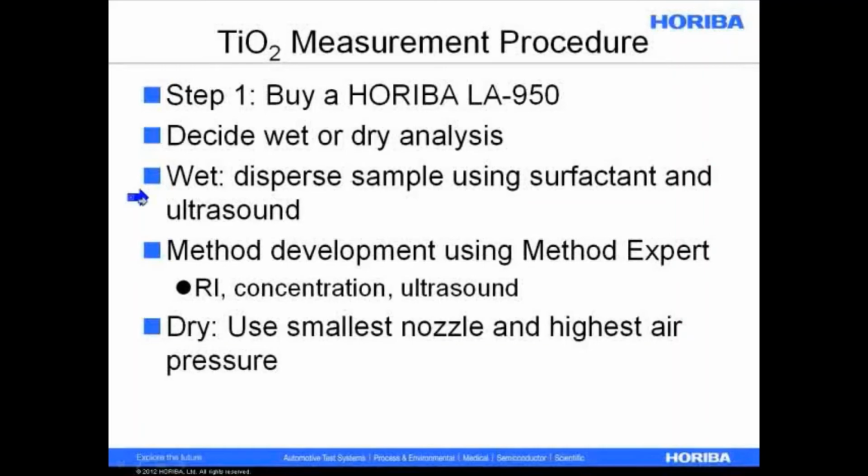Sometimes, often it's dispersed in sodium hexametaphosphate, not just in DI water. And it is typically dispersed using ultrasound, either an external probe or just the probe built into the LA950. So once we get the chemical nature of the method development organized, then we actually are going to, if it's a new product, do some method development with our hands on the instrument.